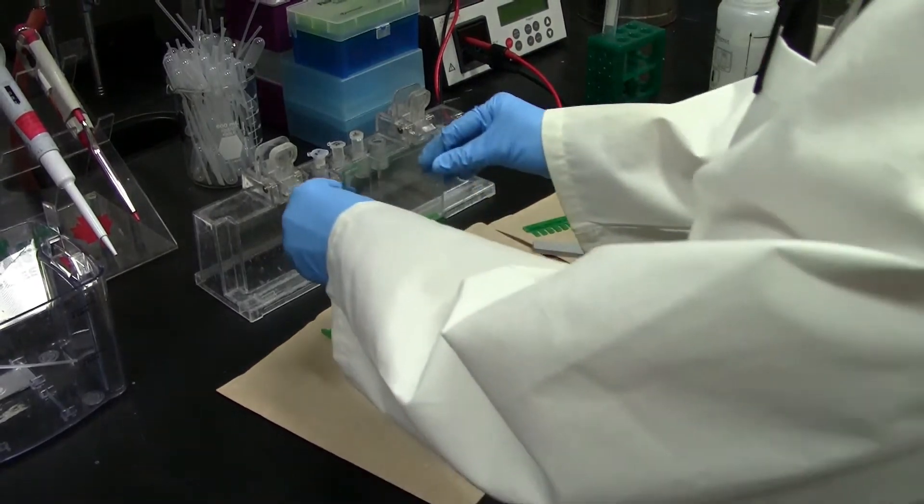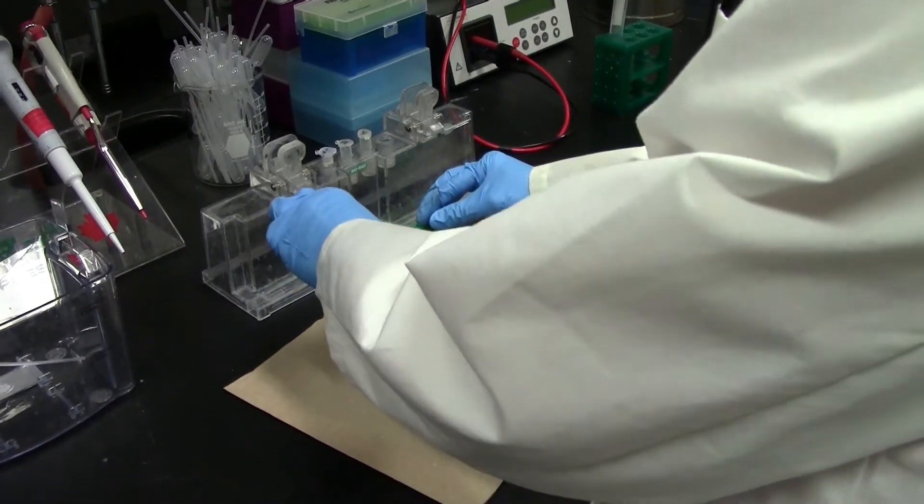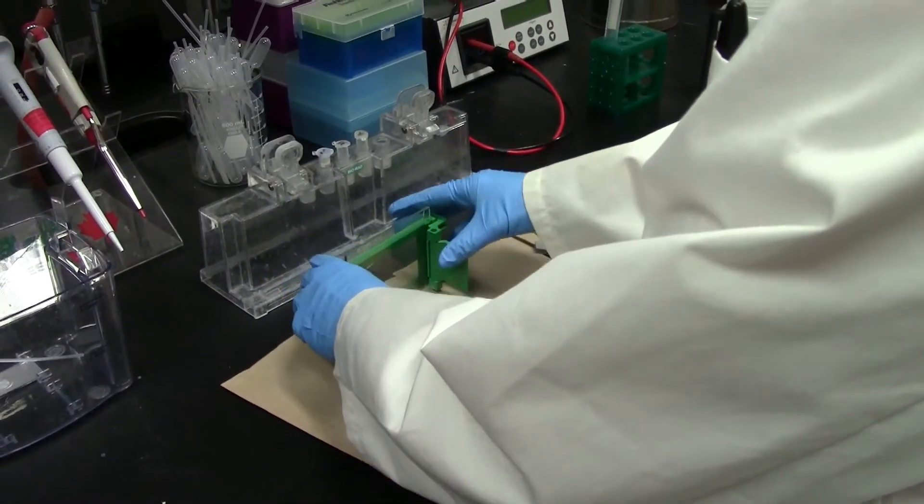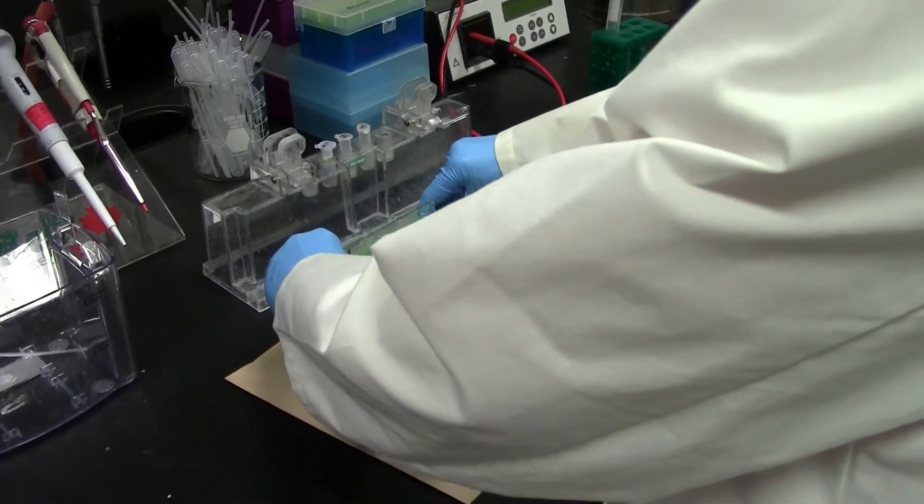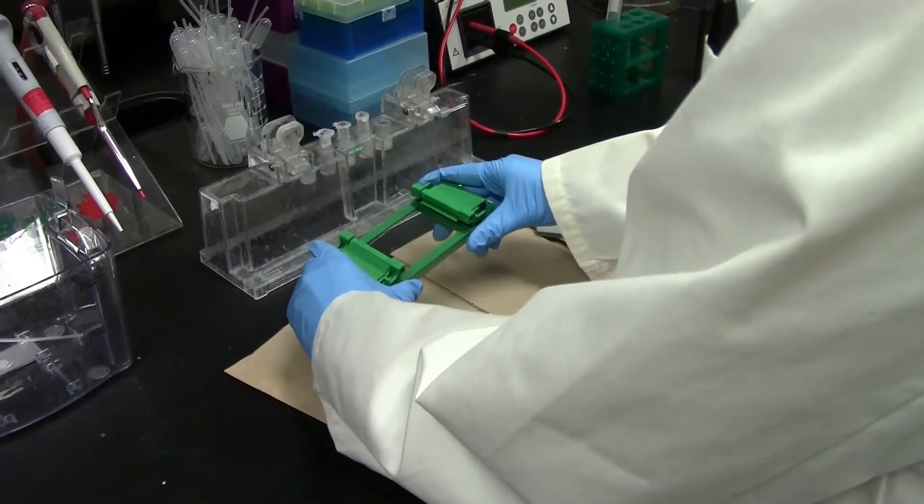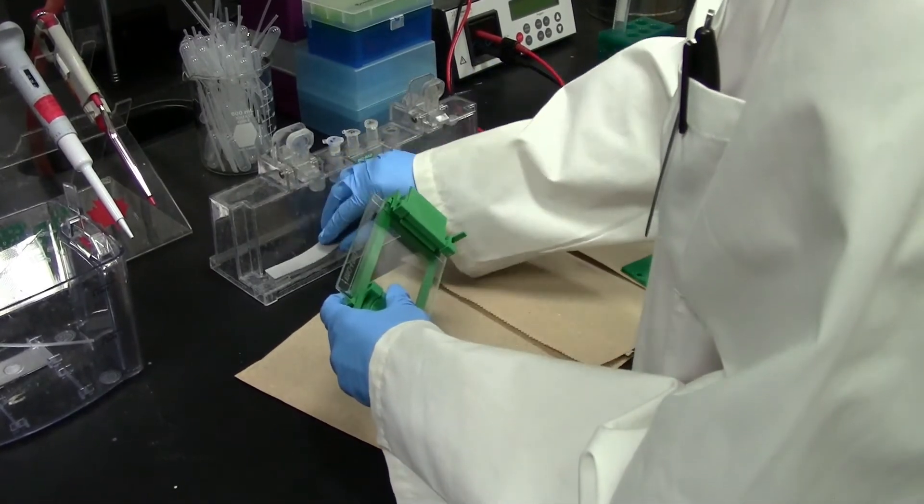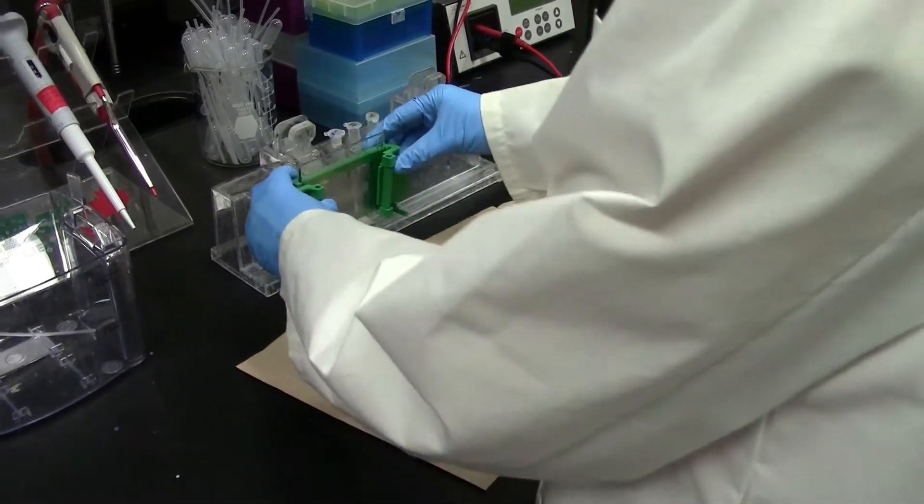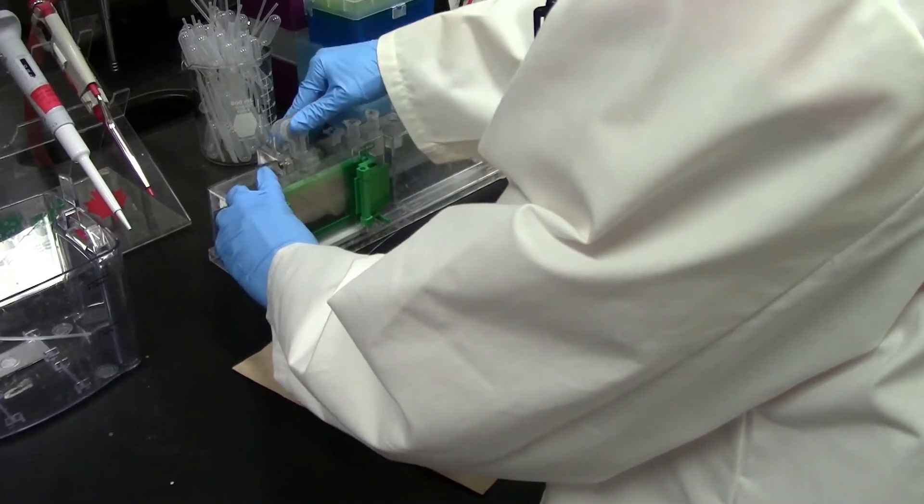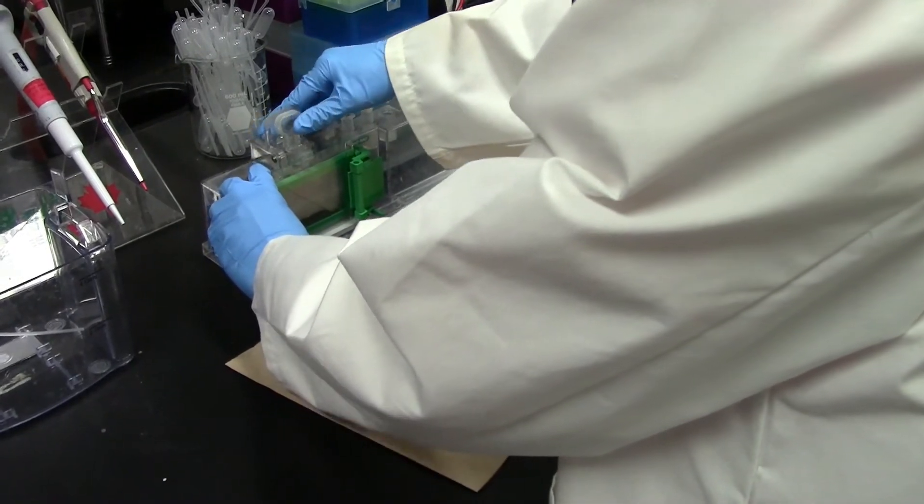To cast the gel, start by cleaning the short plate, spacer plate, and comb with ethanol. Next, assemble the plates together, place them in the casting frame, and clamp them in place, assuring that everything is flush to prevent leaks. Place a gasket on the casting stand and clamp the casting frame into the casting stand.